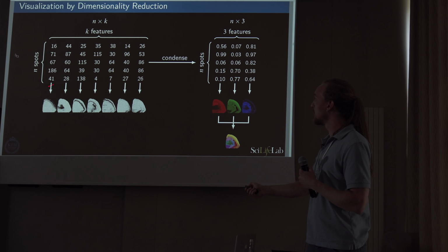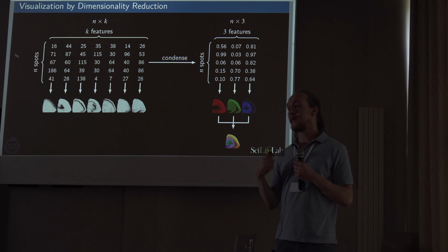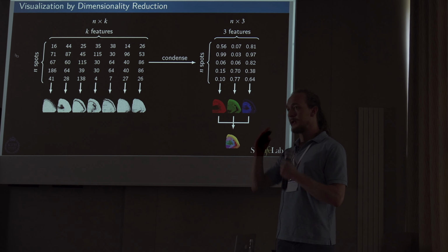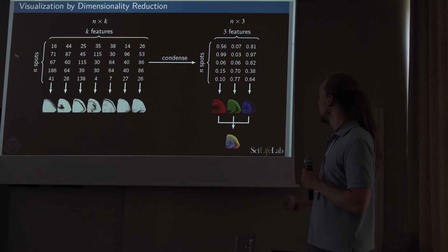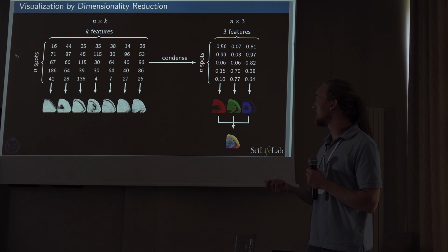You have a matrix with the spots in the rows and the genes in the columns, and you simply apply dimensionality reduction to that so as to reduce the number of columns to 3, which you then, after squishing into the unit cube, basically use as coordinates in color space, so that you can assign 3 color channel bits and combine that in one colorful plot, somewhat maintaining, hopefully, most of the information of the original input matrix.